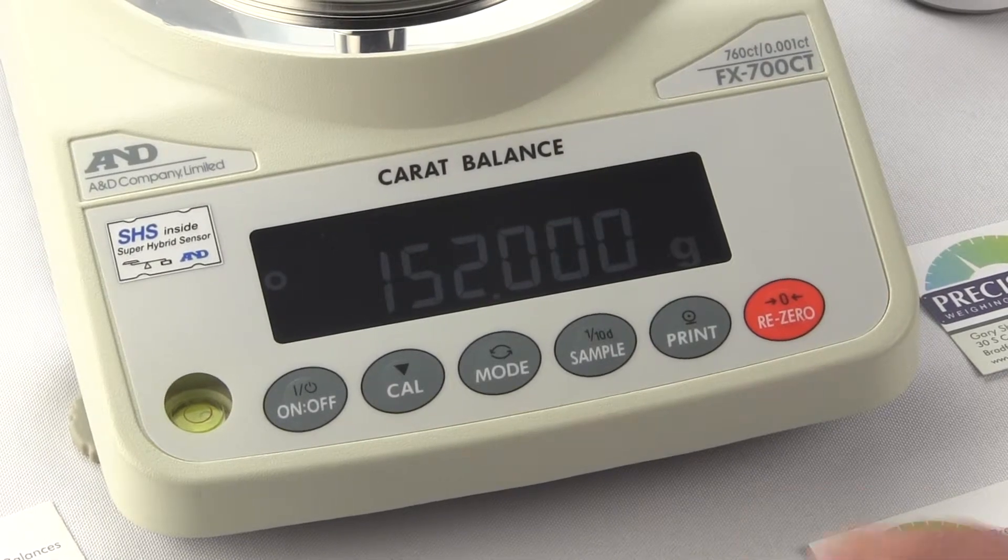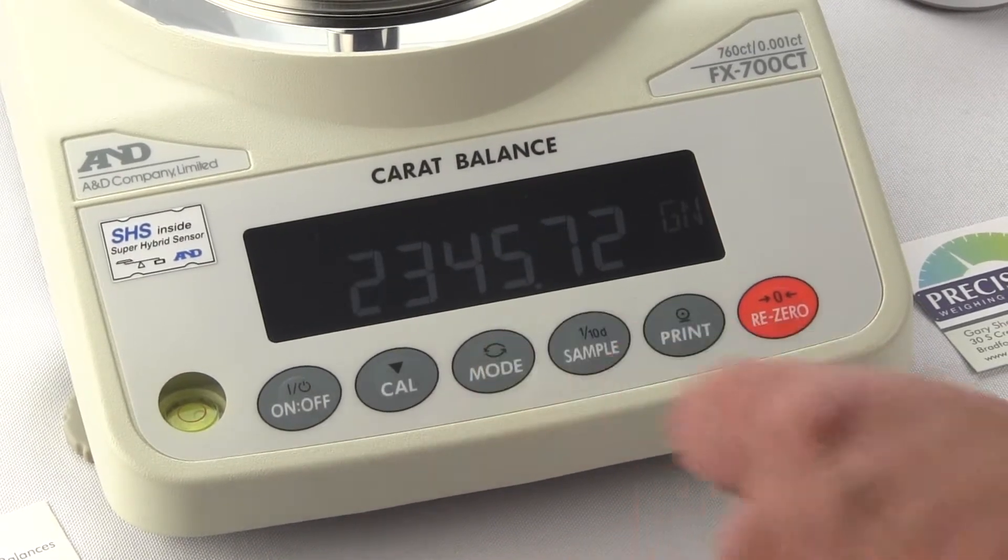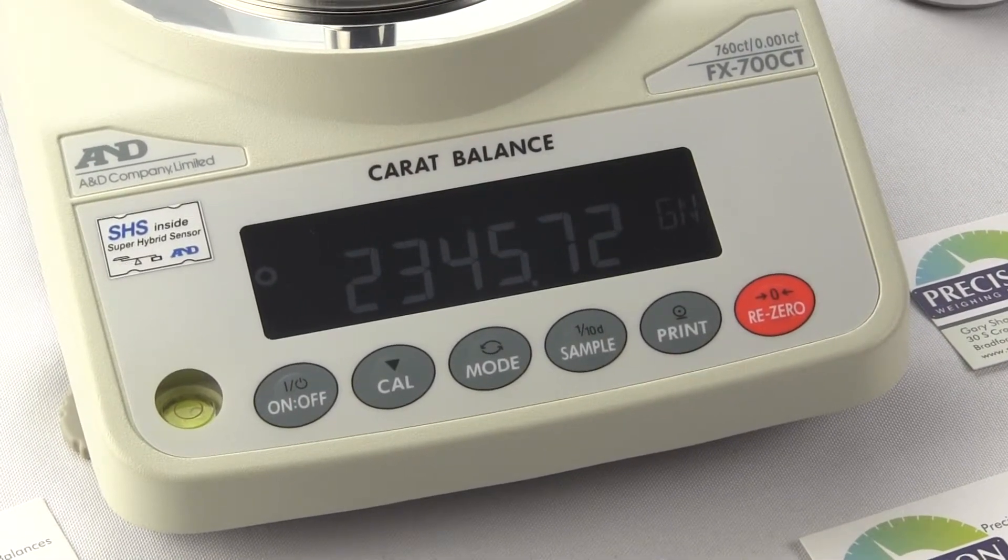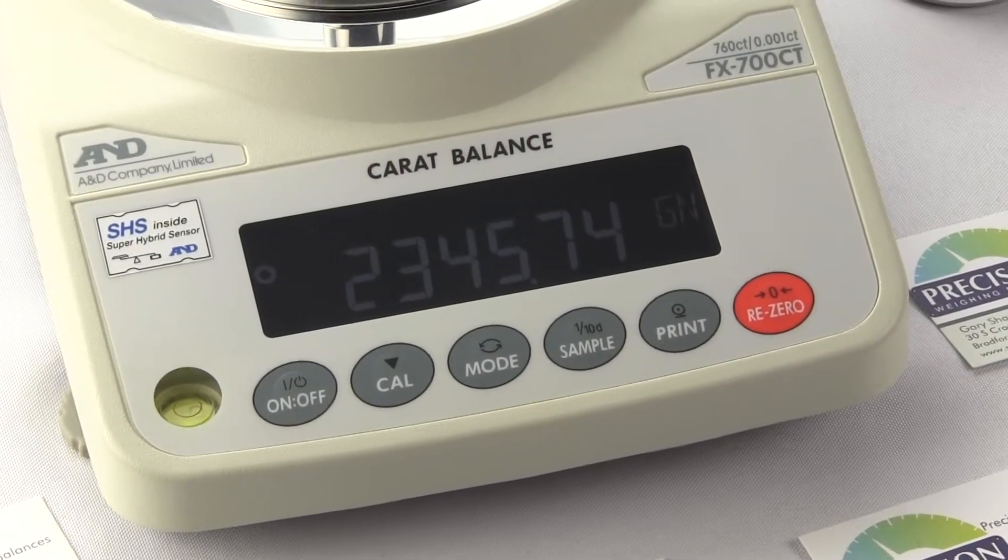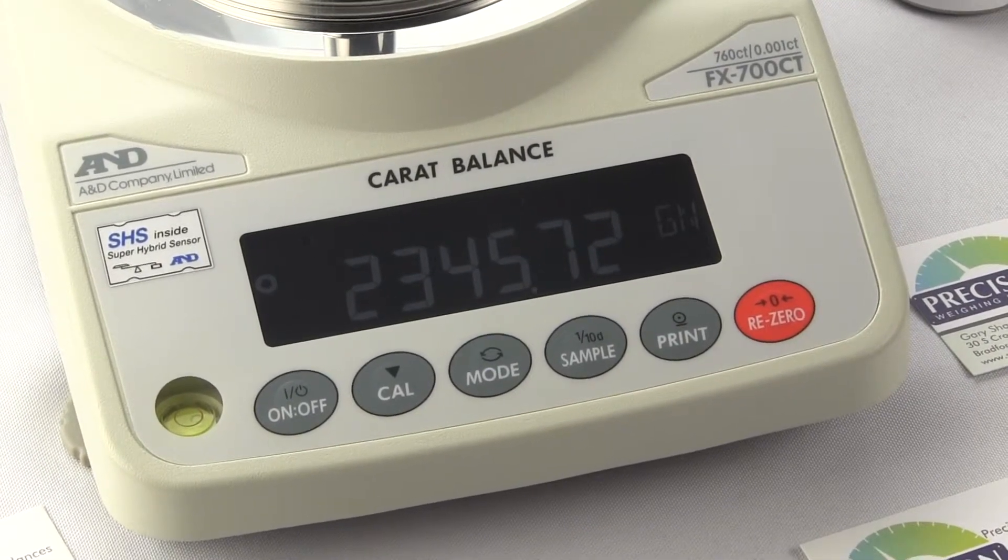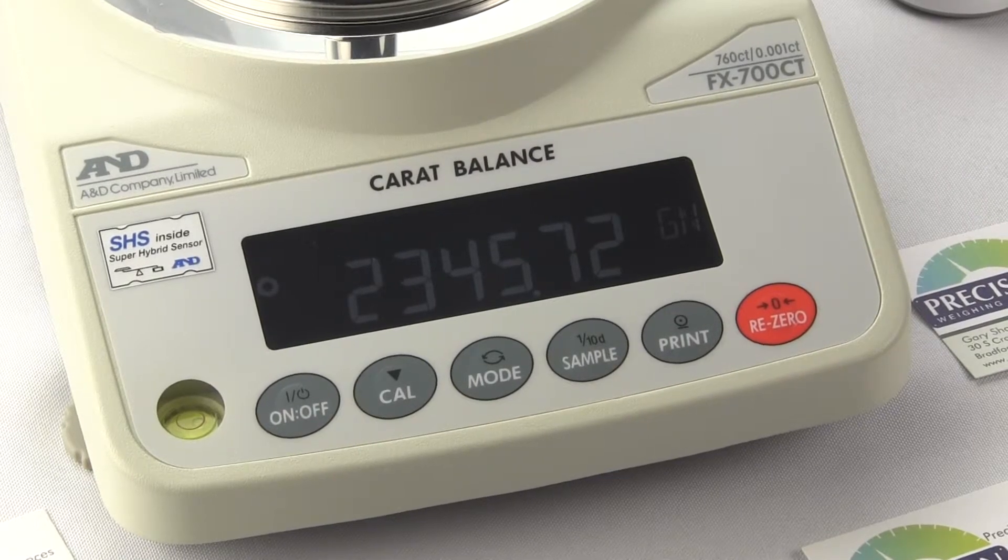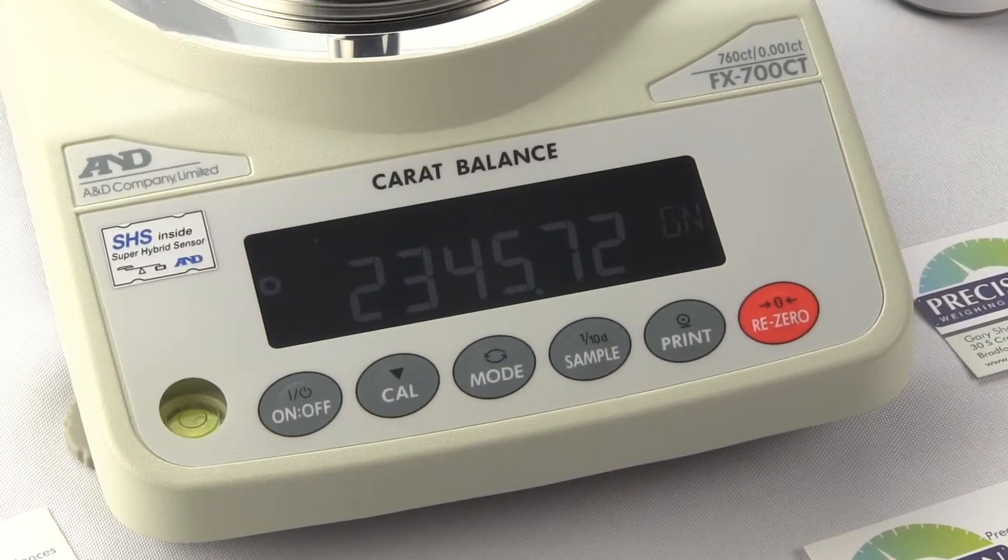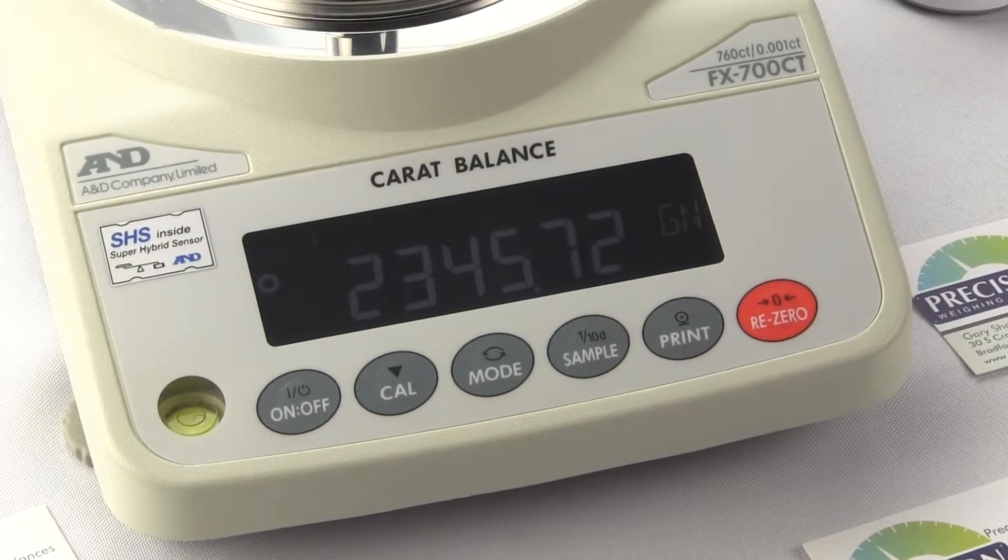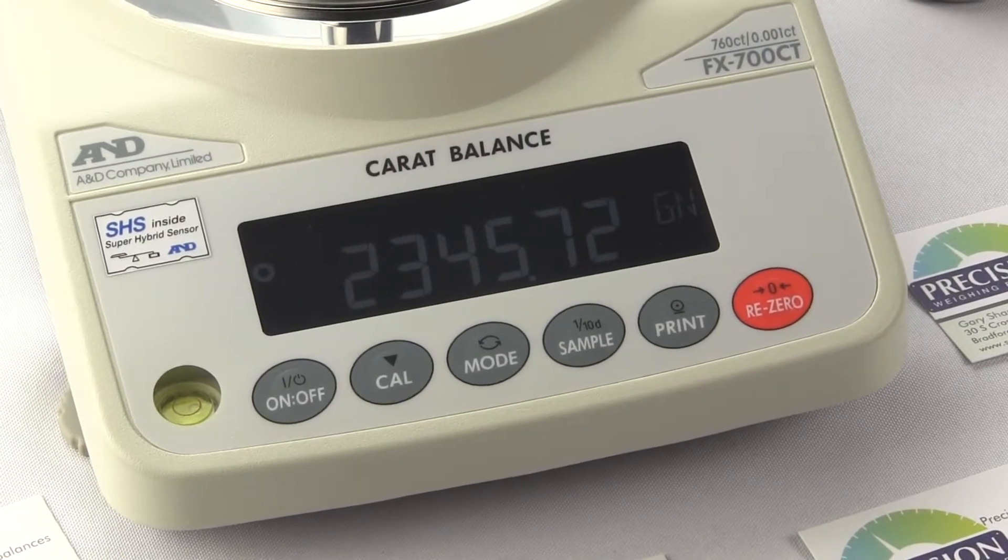The FX700CT can weigh in grains and so you would have 2345 grains and this balance increments in 0.01 grain divisions. The FX700CT has linearity to plus or minus 0.02 grains. That's double the accuracy of the FX120i which increments in 0.01 grains but is only linear to plus or minus 0.04 grains. So for reloaders that's a big difference. You're getting double the accuracy by purchasing the FX700CT plus you're getting that taller plastic draft shield.